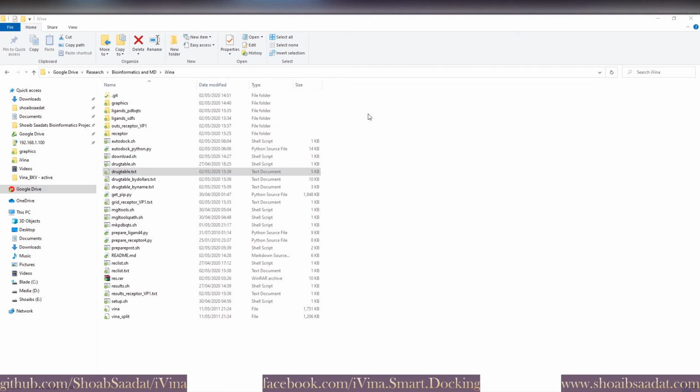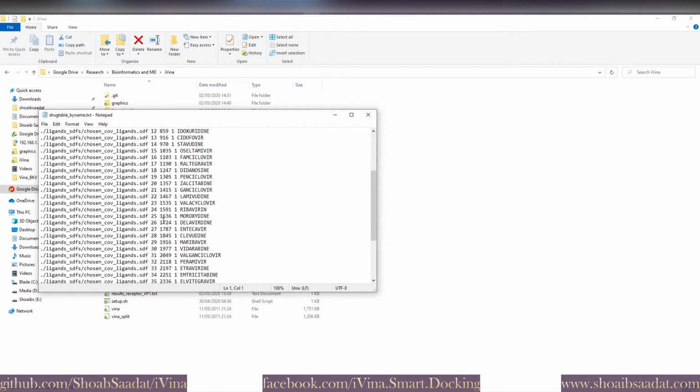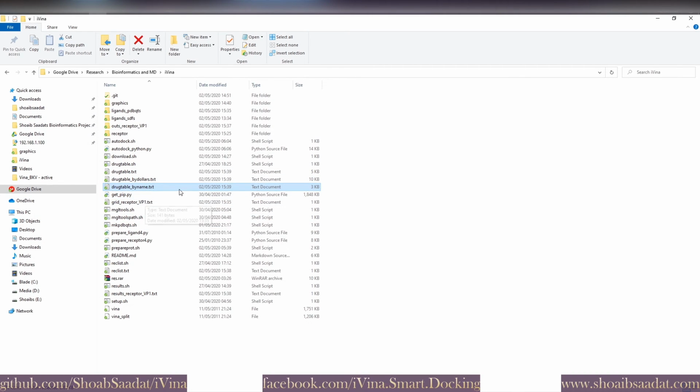delavirdine. Or I could use the table by name as well, go into the same place and find that this drug happens to be delavirdine. In either case, these drug tables help you find out which drug that was, what is the binding affinity, and then at the end of the day you can further refine your results.